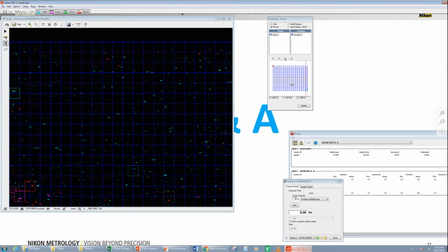Okay, thank you. There's one final question that arrived. Do we need to validate each sample? For example, when we are analyzing 30 samples, do we need to validate each one? Yes, it would be normal to check them out, but normally if the sample prep is good, you would take about 15 to 30 seconds per sample to validate it, because you need to check all the inclusions, not all the inclusions, but all the worst field. Once you have the worst field correct and the polishing is good, normally 1 or 2 steps at worst, and then it's a typical procedure that doesn't take a lot of time.